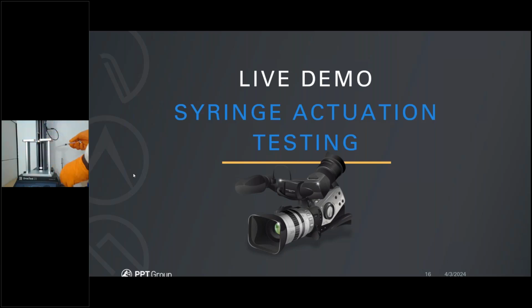So that is our syringe. Take that out of the box here, and then we just slide that through our die and simply insert that. One of the other things we'll do as part of the setup is to bring our compression probe up just so we can pull the syringe to a point where we are ready to start the test. So this is technically all there is to the test setup.